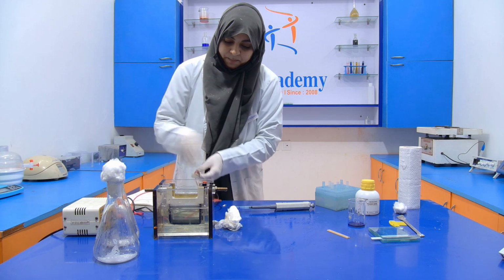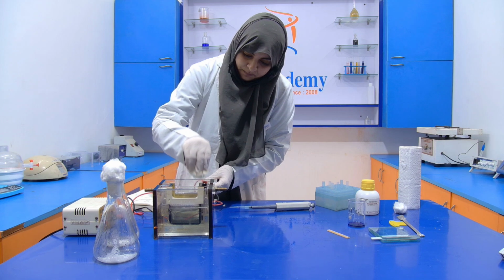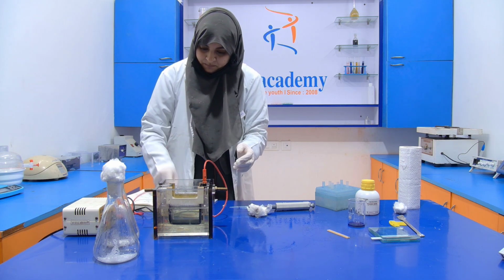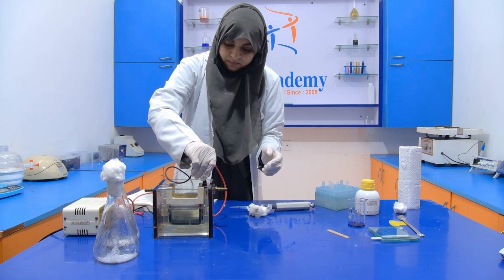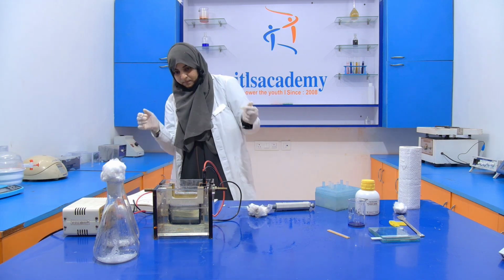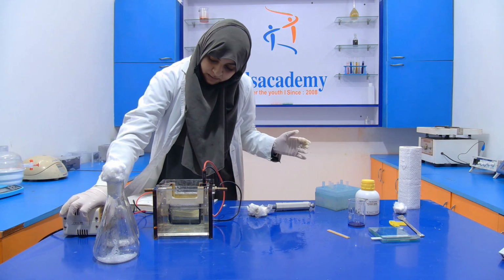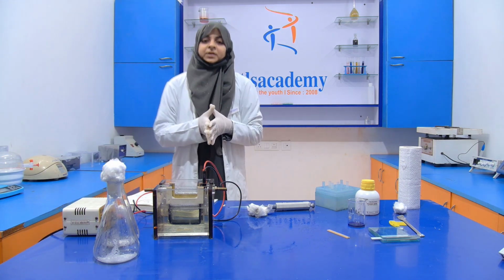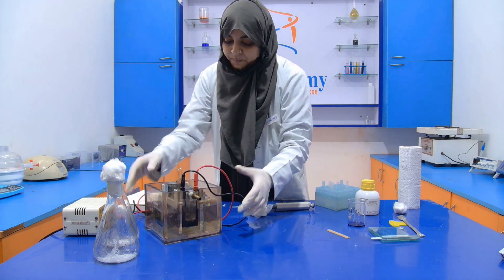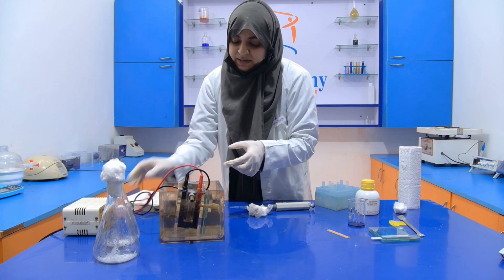connected with the power pack. Then switch on the power pack, set it around 150 volt, and then start the experiment. Okay, so it takes around 1 to 2 hours to get a result.